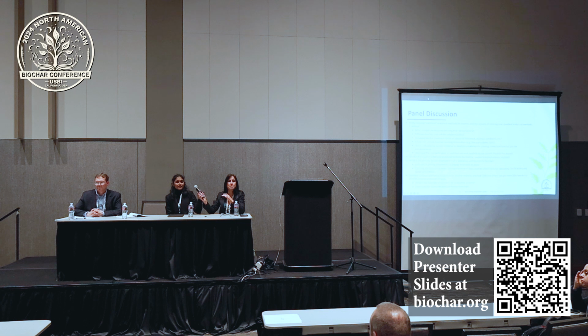Another comment to the hydrogen. Maybe Chris could speak more to this, but there's different ways to categorize the hydrogen. This is why standardization is important, because in the methodology, different methods do it a different way, incorporating the moisture content into the original hydrogen number, which can over-calculate or overstate the hydrogen to carbon ratio.